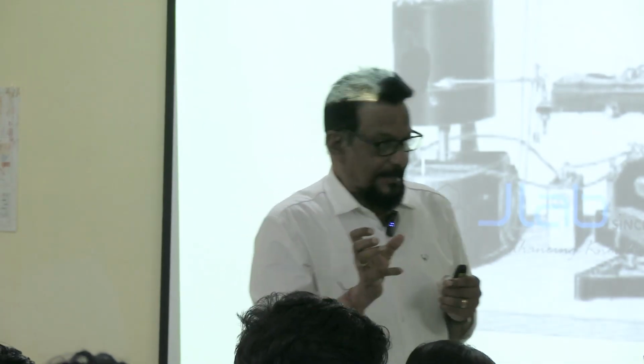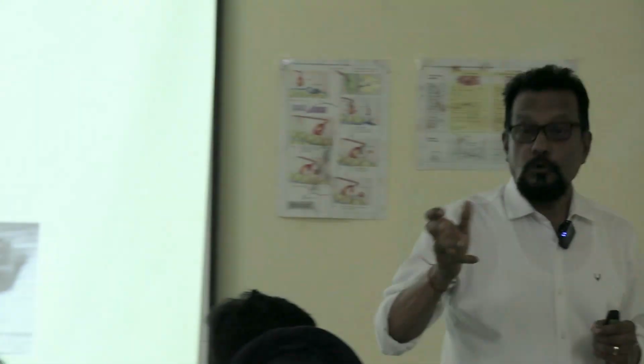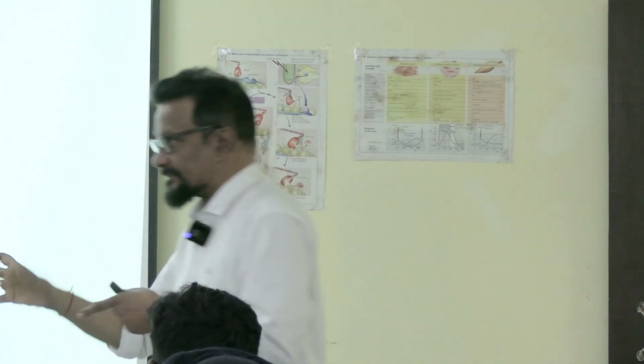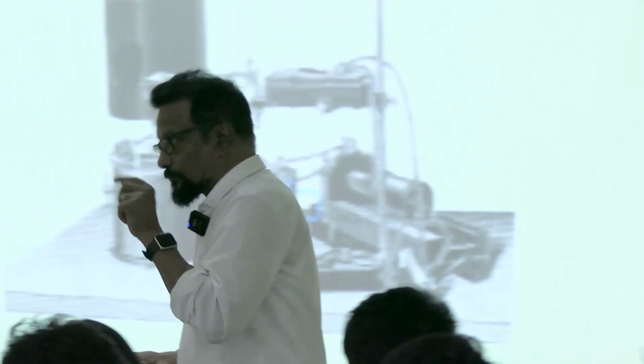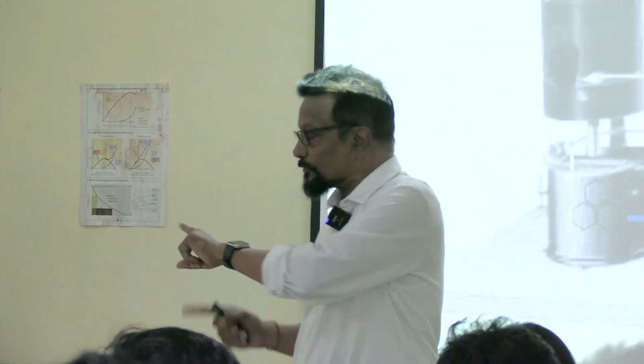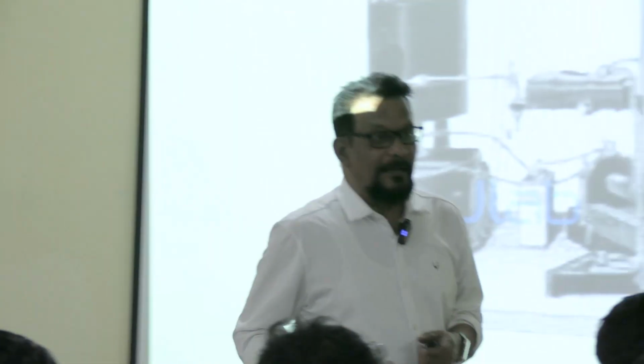So DC current will be produced. Now you can adjust the output, what voltage you want, whether 5, 6, 10, 12 or 20 volts. You can decide the output, and I will send this output voltage to the primary coil of the Du Bois-Reymond induction coil.